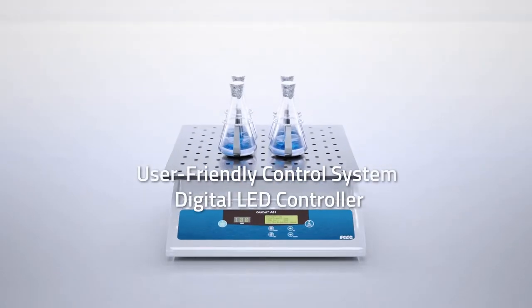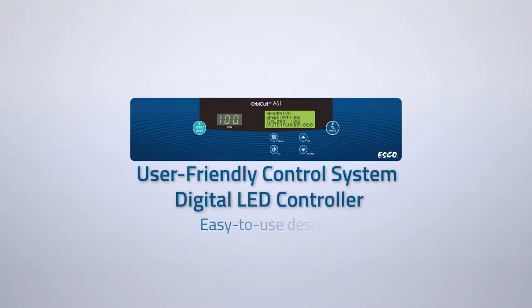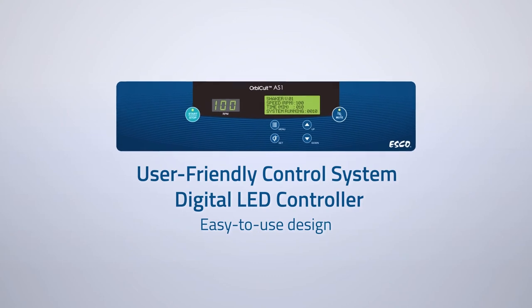User-friendly control system with digital LED controller. It has an easy-to-use design that allows for accurate parameter setting.